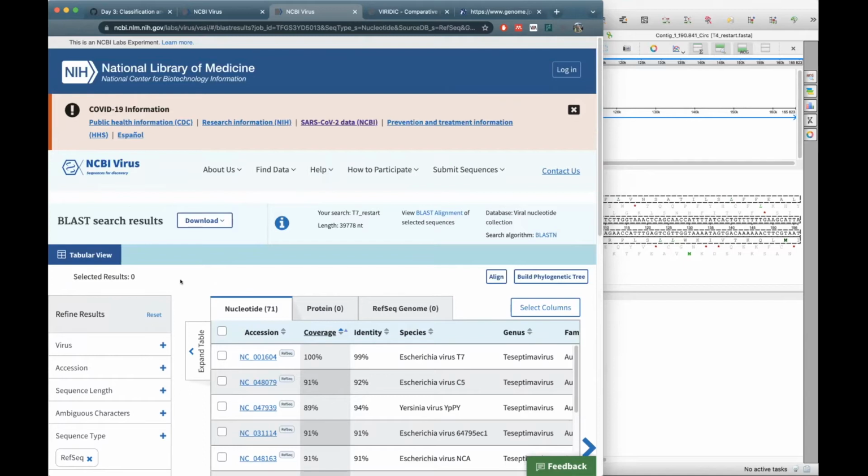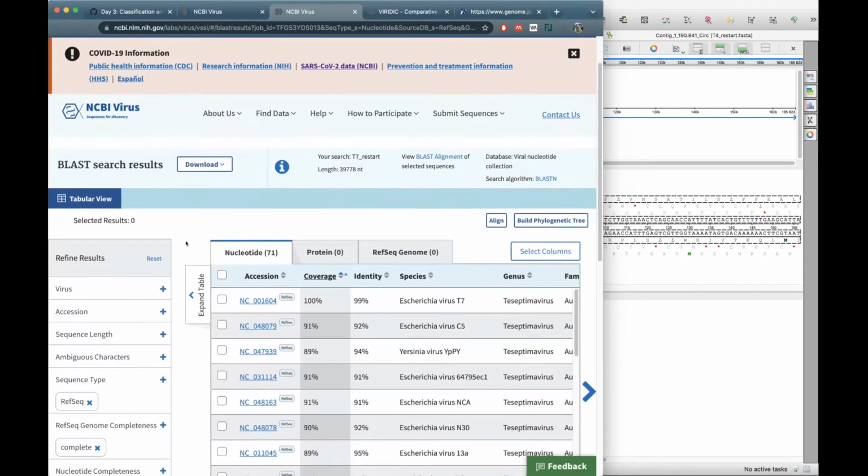Anna, do you have another question? Yes. What will be your cutoff for the coverage and for identity to trust that this is the species that you have identified?